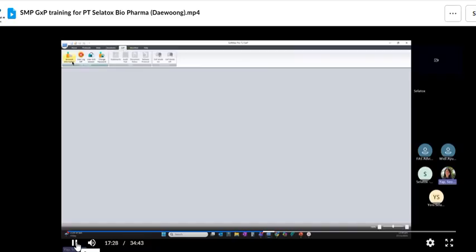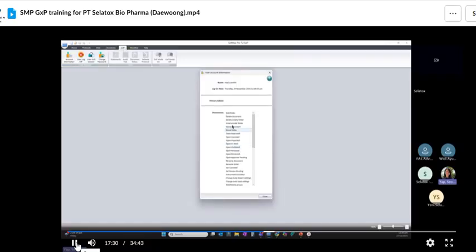So here you can go to the account information. You can check you as a Med Scientist, these are your permissions. You can add folder, you can do set cancel and so on. You get to see what you can do.